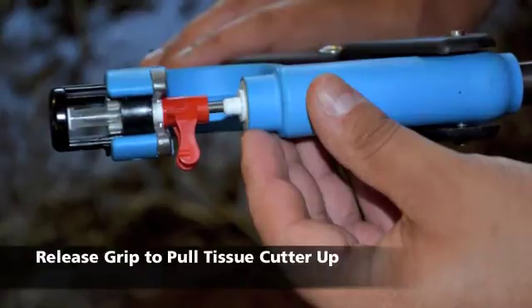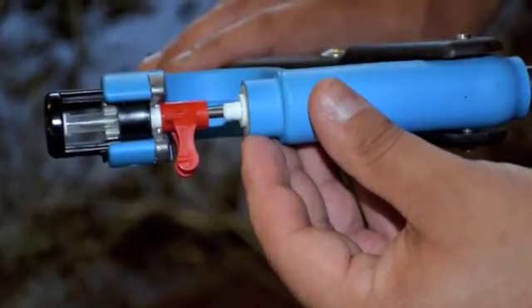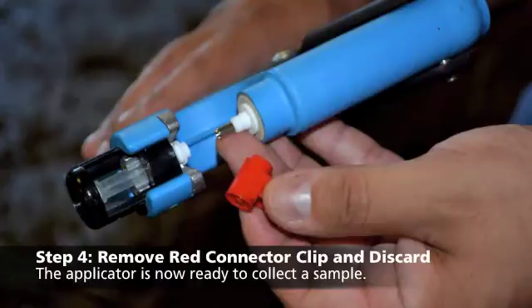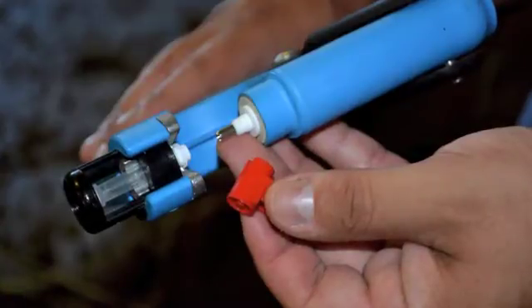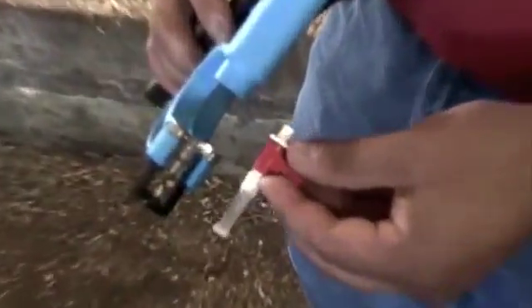Next, release the handles. You will see that the tissue cutter has separated from the rest of the unit and is in place to use. Finally, remove the red plastic connector clip by pushing downward until it unclips. Take care not to cut your fingers on the metal tissue cutter as it is very sharp. The red connector clip may be discarded. Here's a closer look at the applicator being loaded from start to finish.